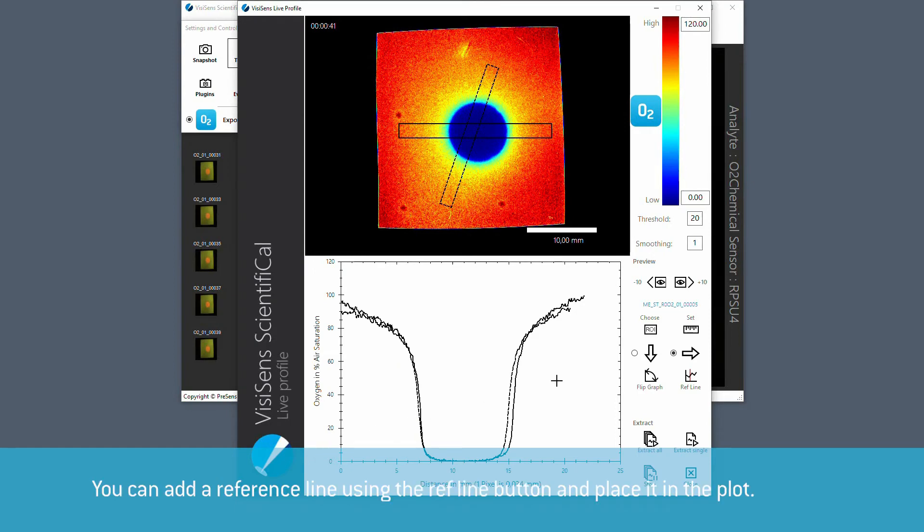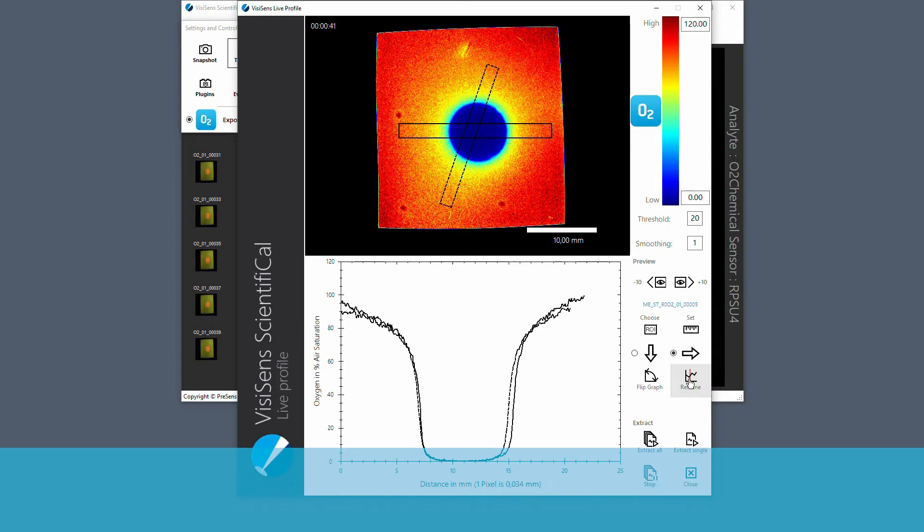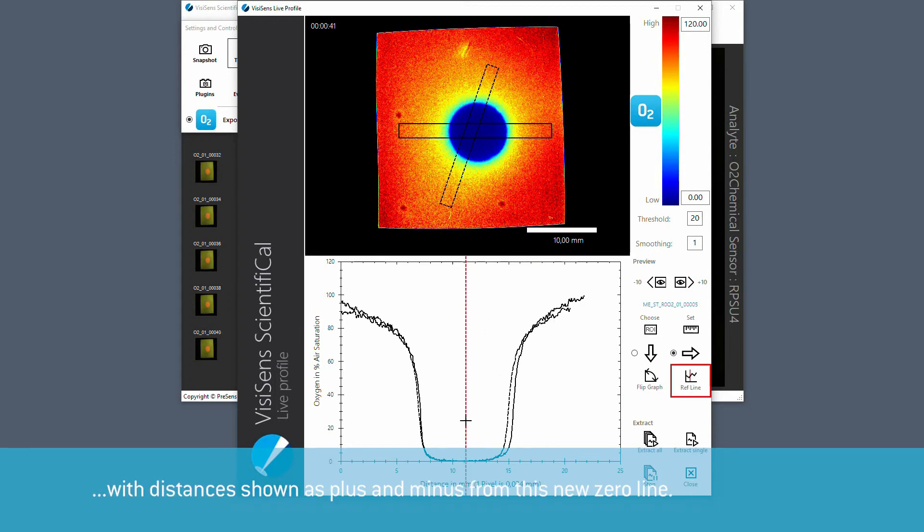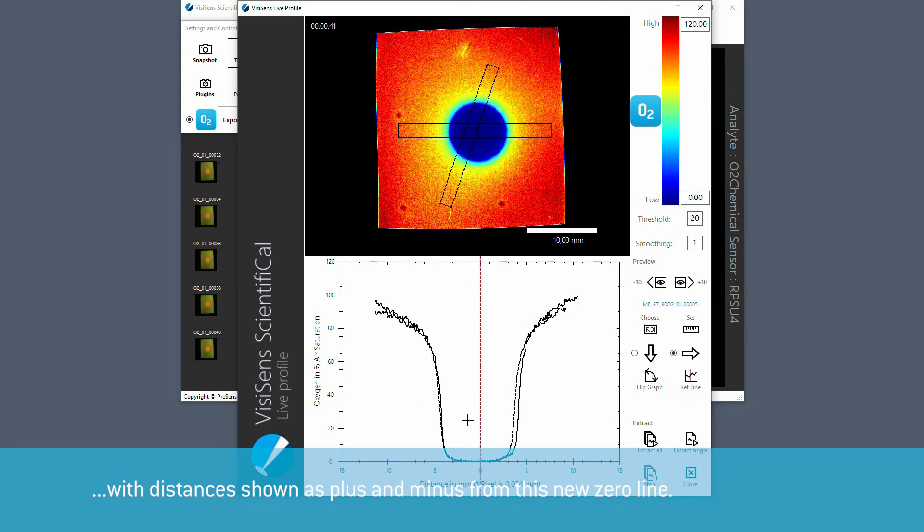In a live profile window you can add a reference line using the ref line button and place it in a plot. The reference line will be set as zero with distances shown as plus and minus from this new zero line.